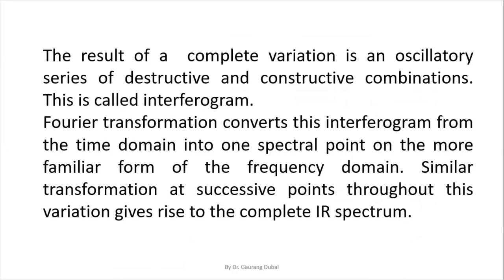Fourier transformation converts this interferogram from the time domain into the spectral form of the more familiar frequency domain. So what happened? The Fourier transform will convert this interferogram to the spectrum, and we are familiar with the frequency domain. So it will convert into the frequency domain. Whatever we desire, whatever we are expecting, a frequency domain graph will be obtained by the Fourier transformation process.